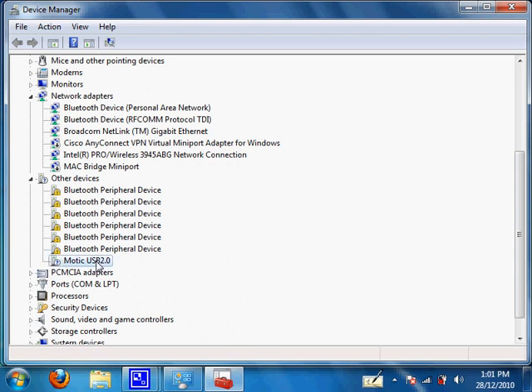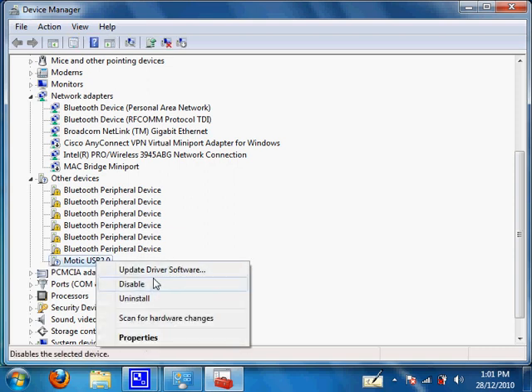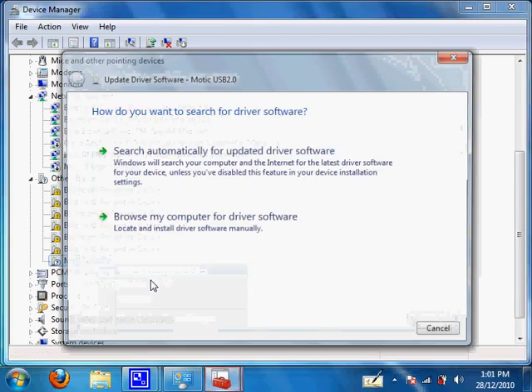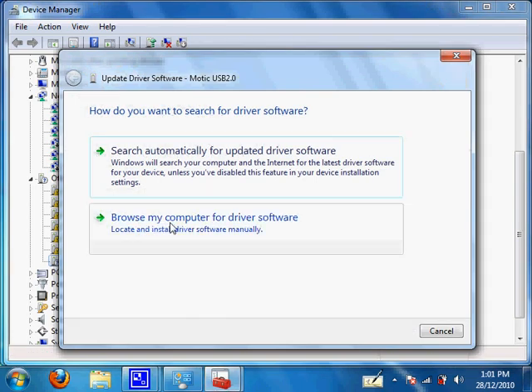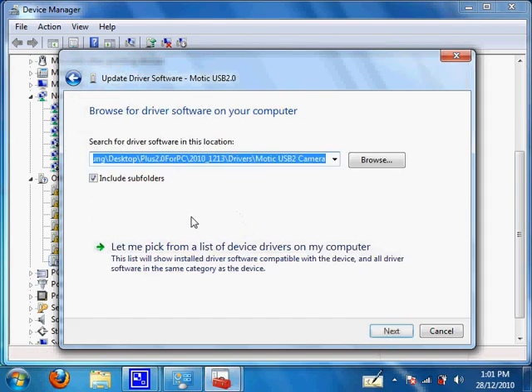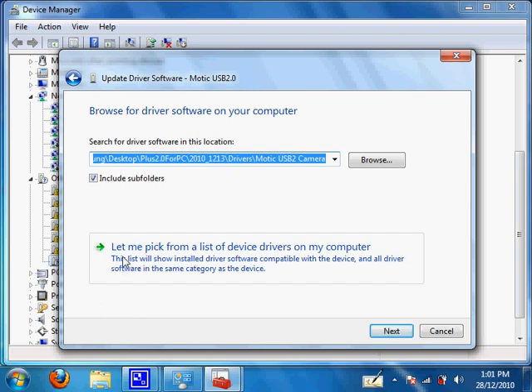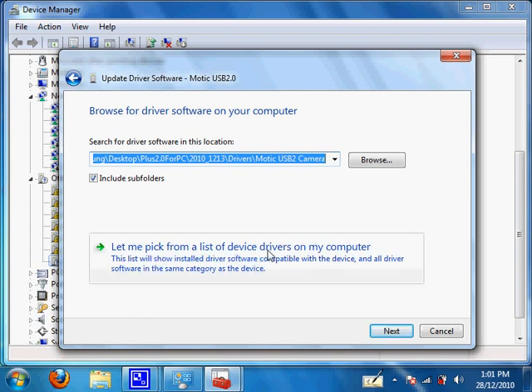The important part is to right click on it, click update driver, then click on browse my computer for driver software, then click on let me pick from a list of device drivers on my computer.